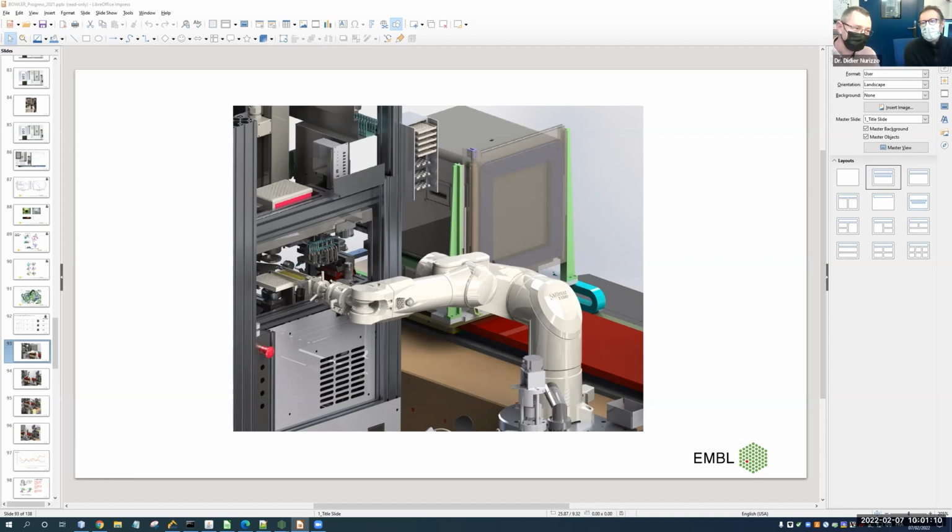We have to go for that as well, and that's something we are still working on: trying to have this kind of way of working, which is completely automated, even if instead of us starting the workflows on all the samples, it could be you, the user, starting. But the automated data collection should be available on all the other beamlines.